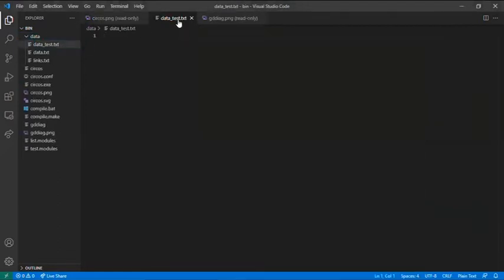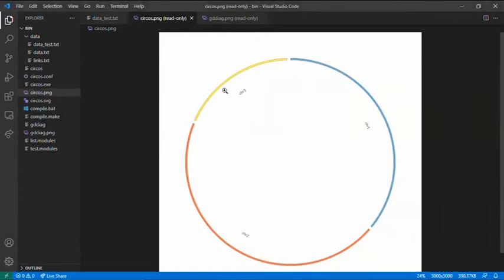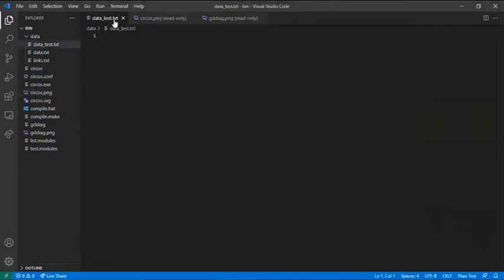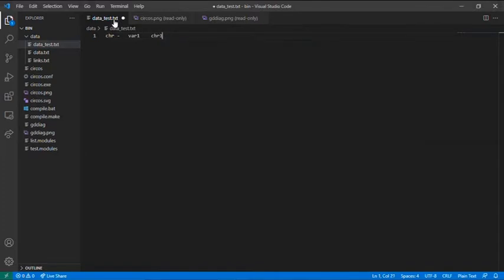In here you have to call every variable you want. In here I have three variables, so how do you plot this? Chromosome, space, and then a tab. And the name of the variable, I will call it var1. The name of the label, I will call it Chromosome1.